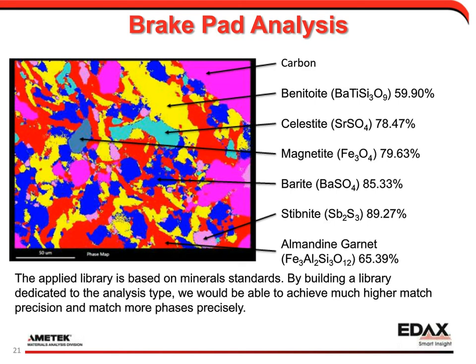But if we had built a library dedicated to this, if we knew what compounds to expect in a brake pad, we can build a dedicated library and have much better match precision and matches for more phases.